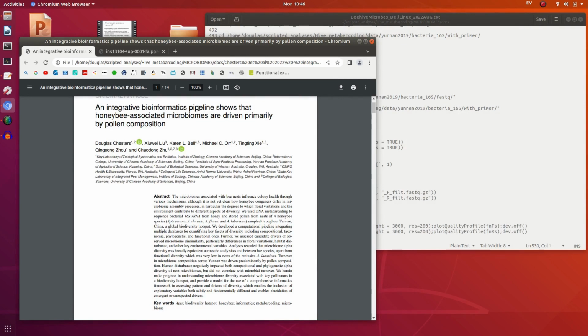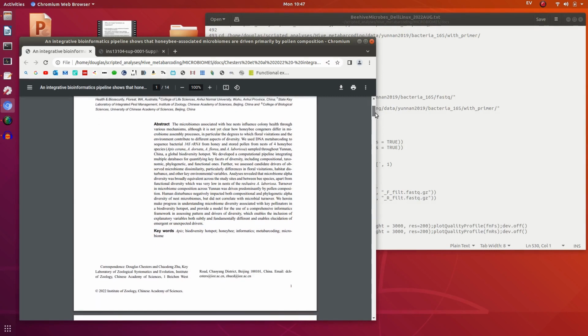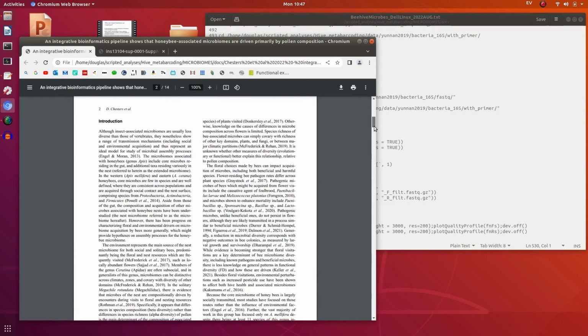So a pipeline, as always, building these, and this is applied to honeybee nests, microbiomes in these. One thing that struck me from studying microbiomes is it's considerably easier than trying to do metabarcoding for plants or higher taxa insect communities, and a lot of the methods are built primarily on this system. So on 16S, it's very easy to get high quality data, so you can consider that if you're looking for somewhat of an easier domain to work on, an easier job of getting reliable sequence data.